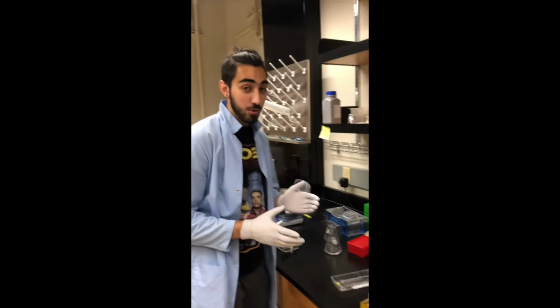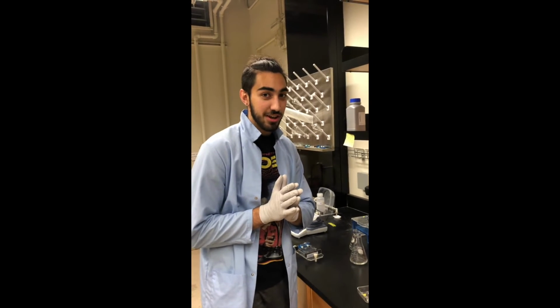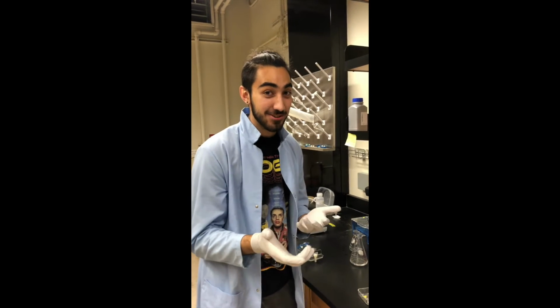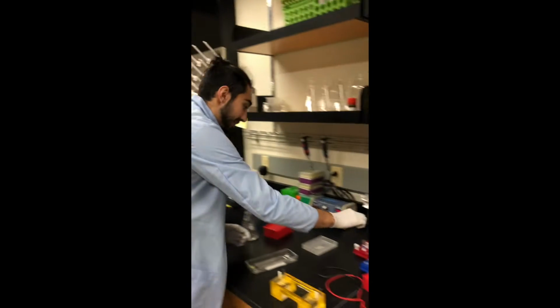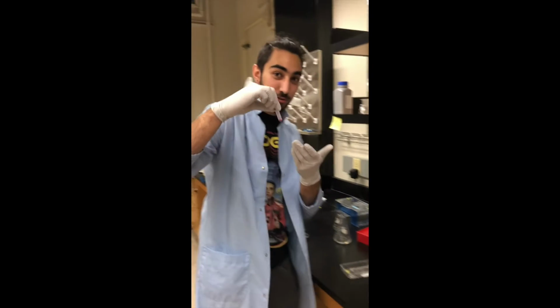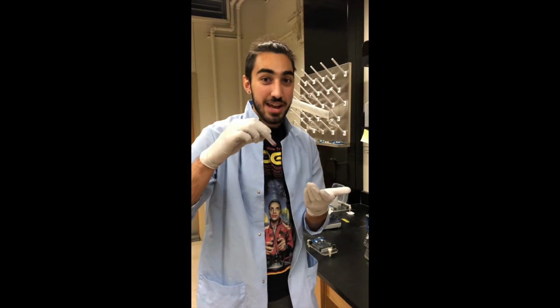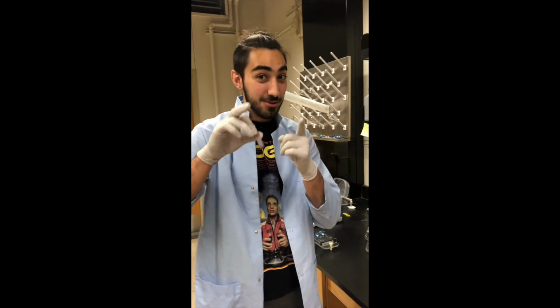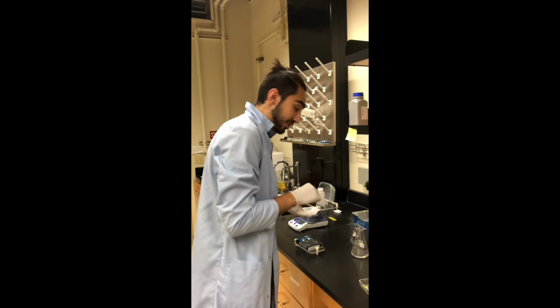Now this next step, we have to be extremely cautious because we're working with a carcinogen, which means you get cancer if it gets on your skin. So we have to be extremely careful. What we're going to do is get this cancer juice, which is ethidium bromide. It's red, and you know it's dangerous because red means stop, and that's not a good thing. But we have to use it anyways because it has to make our gel solidify.